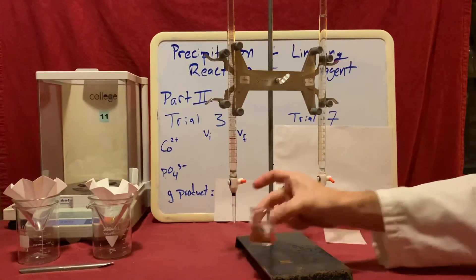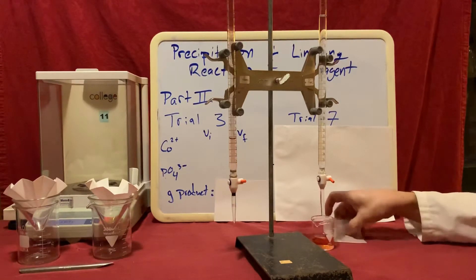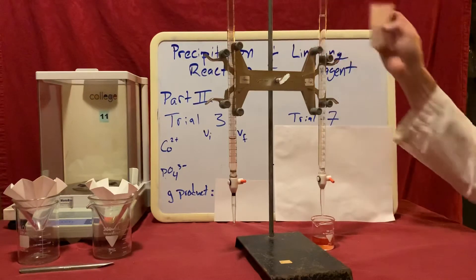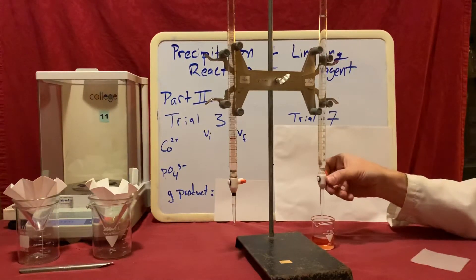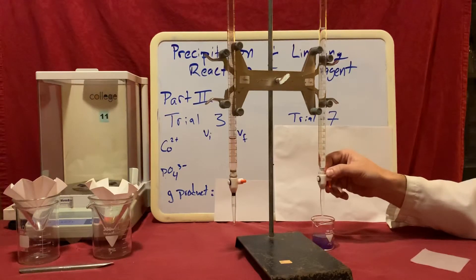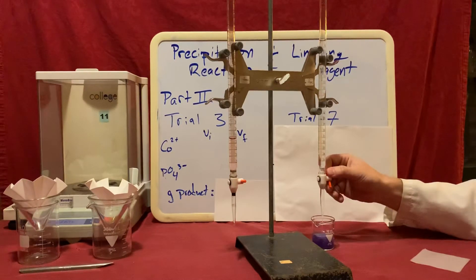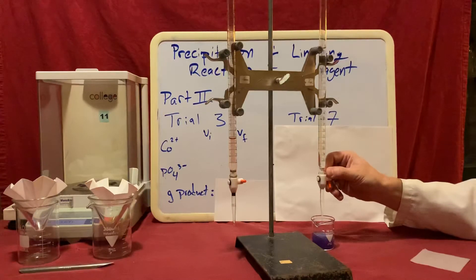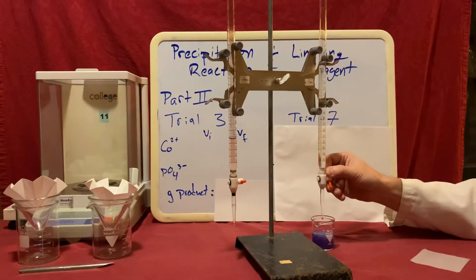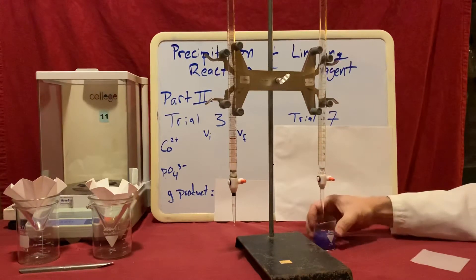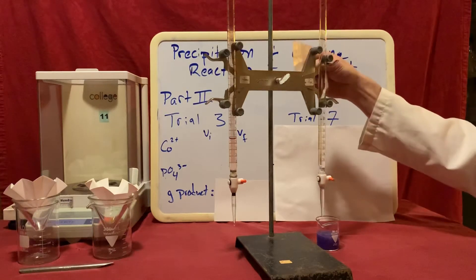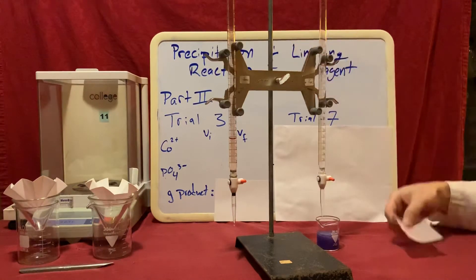I'll then dispense the sodium phosphate solution. I'll note that my initial volume here is 1.00 milliliters. As I dispense the solution, I note that my product starts to appear as a purple solid that precipitates out. I want to add approximately 8 milliliters, so as I started at 1, I want to end as close to 9.00 milliliters, and I'll note that I actually managed to stop at 9.00 milliliters.